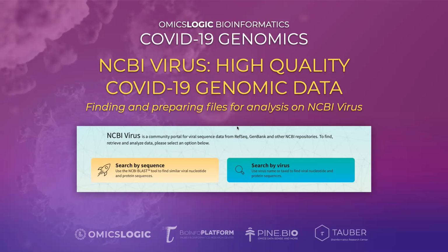We can also see a number of different proteins and compare them to other viruses and other proteins as well. So we'll talk about that and do some hands-on and discuss how some of you might come up with a hypothesis that you can actually explore using some of these data sets.